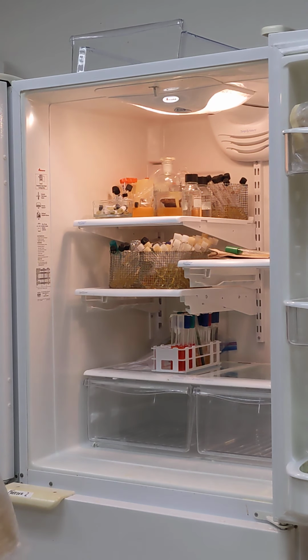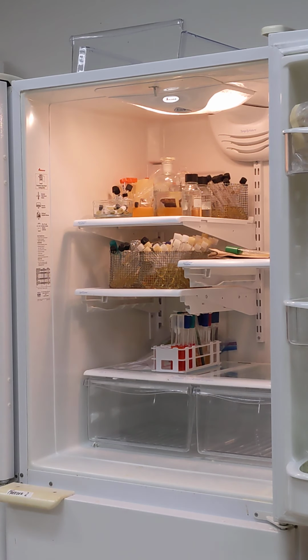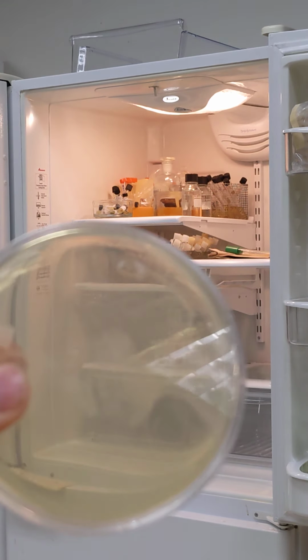Plates are a really common and easy way to grow microbes. Very easy to access, to use them. What you're going to see is we just have these solid plastic dishes with a layer of media inside of it. Now, in addition to the normal plates that I just showed you here, we also have what are called slants, deeps, and broths. So I'm going to grab out a few of these to show you some examples as well.